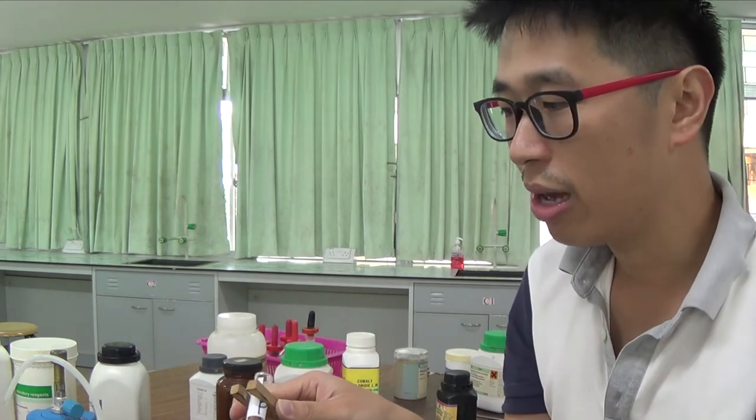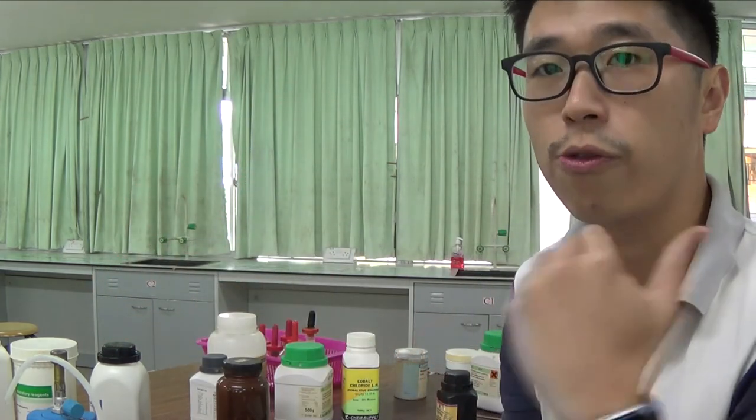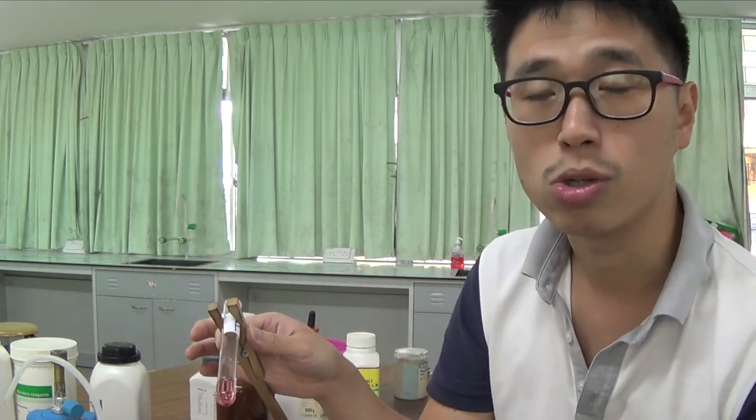A lot of transition metal chemistry is actually reversible. And because the compounds are colored, it's very easy to follow them by the color changes, indicating that there is a reaction happening one way and a second reaction happening the other way as well. Therefore, this is a very good way of teaching students the idea of reversibility.